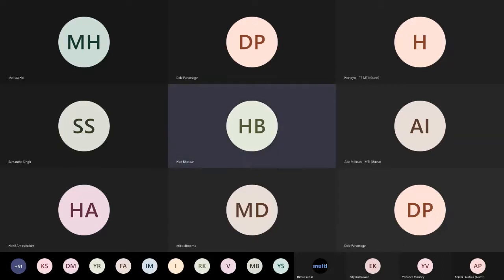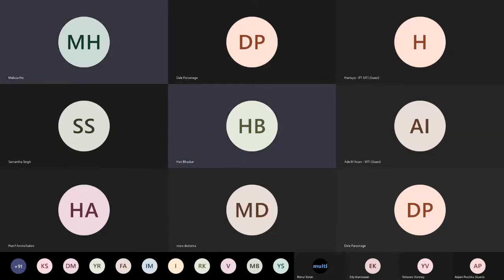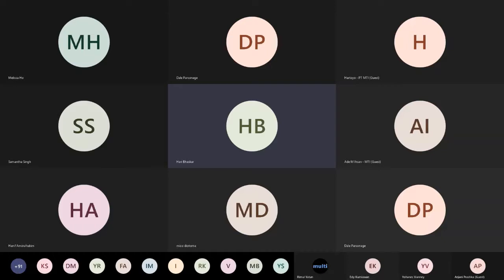In fact, we normally supply a wall chart or an easy reference chart with screenshots and procedures. So in my opinion, anybody who is able to read that can easily set up the calibration. And a typical calibration does not really take that long. Probably in 1 or 2 hours, you should be able to set up a calibration.